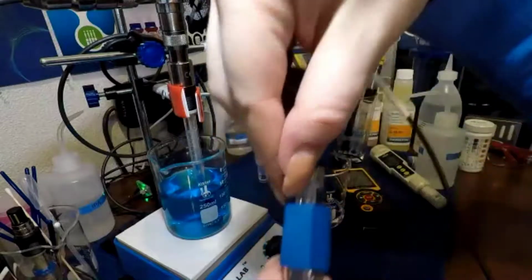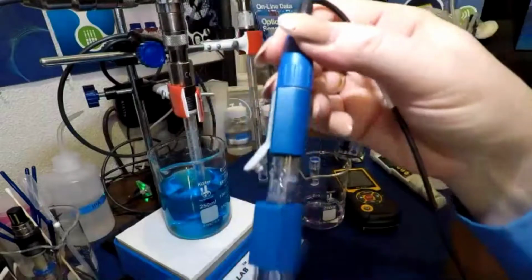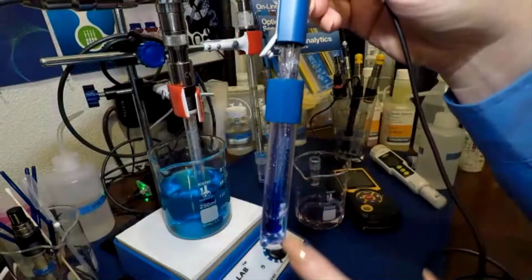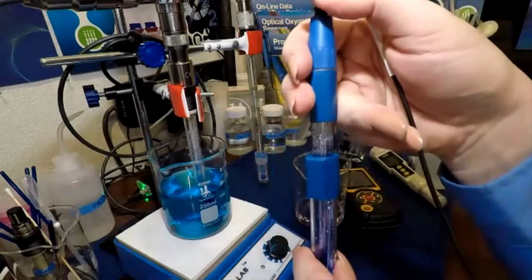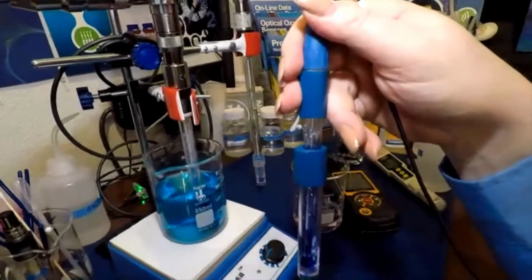When you're taking measurements, you need to make sure that plug is open, because the liquid needs to be able to flow down so you get that ion release into the solution so you can get a measurement. If you have it plugged in, it's like a straw. If you put your thumb over the end, no ions will flow, no liquid will flow, your measurement won't work.